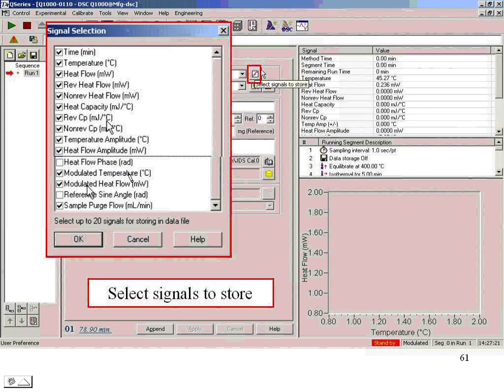For those that have a DMA, when you put a stimulus onto a sample and measure a response, there's a lag in that, right? Depending on where you're at in the structure of the material, it may be in phase, it may be out of phase. In modulated DSC, typically we don't see that it becomes out of phase until in the middle of a transition like a melt. And normally we don't worry about that because we're not looking at the reversing and non-reversing independently or quantitatively. We're looking at them together. So this is why we recommend you do this.